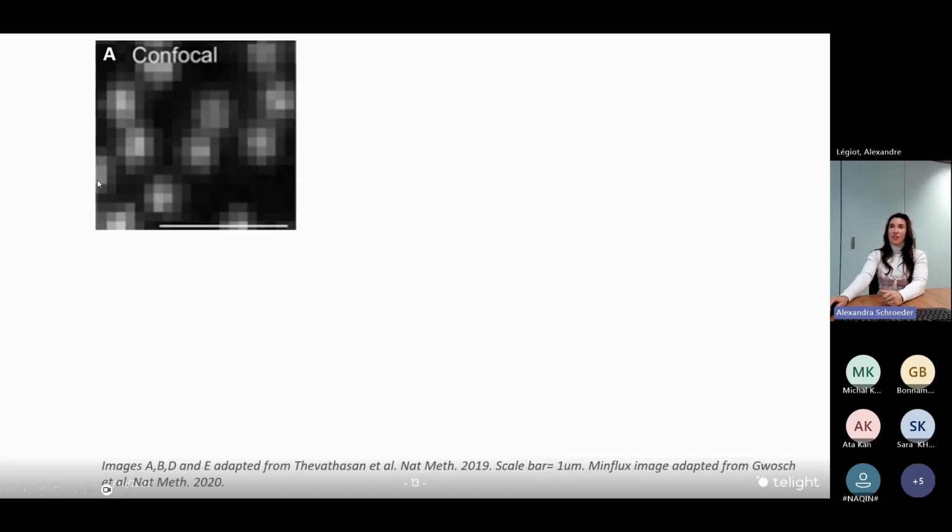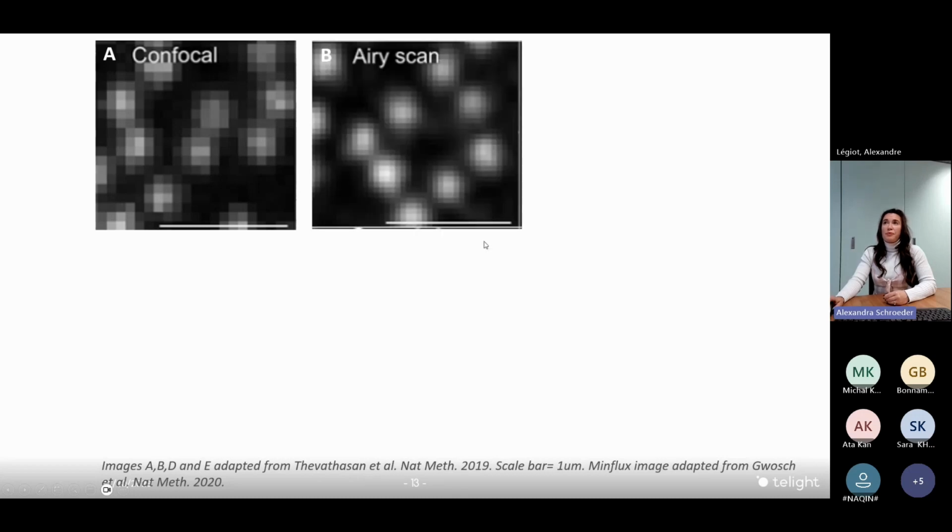So where we begin, here's an example of what the nucleopore complex looks like when you scan with confocal laser scanning microscopy. Here we're using a diffraction limited technique and scanning with an airy spot. So all we can see, in that analogy, is the entire football field when we know we should have tiny little points all around here. But it can still help to quantify the resolution of your confocal microscope by seeing how small you can create this radius or these 2 separated points.